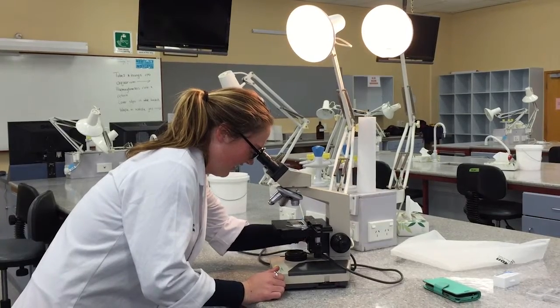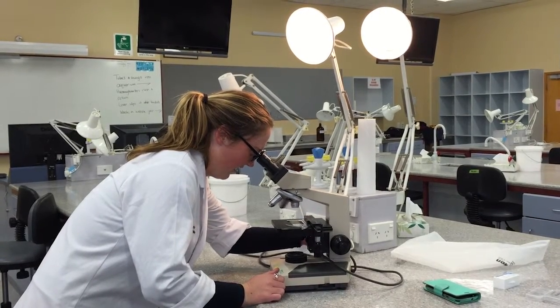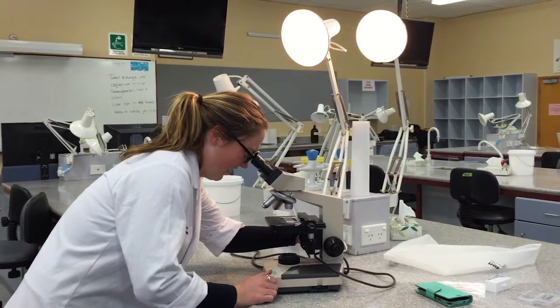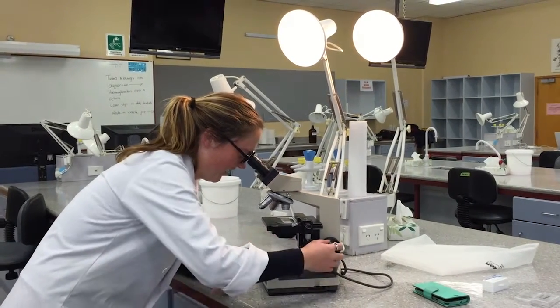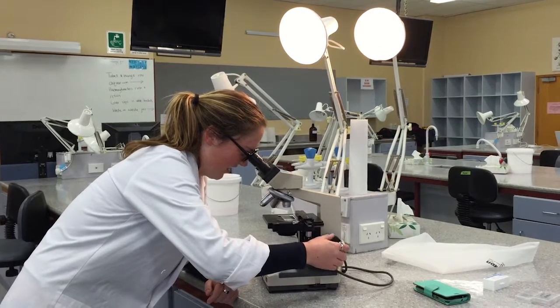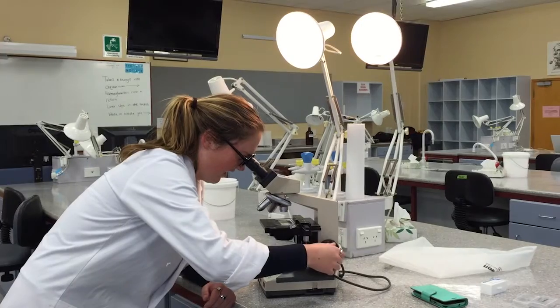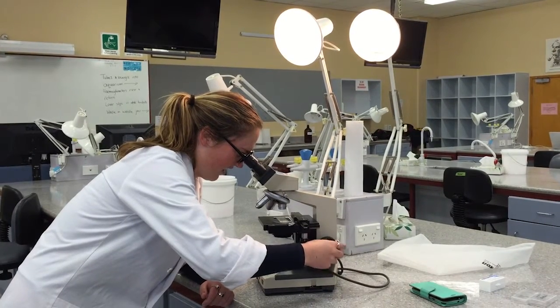Ensure the stage is lowered and the low power objective is selected. Cover the microscope with the plastic protective covering and, lifting by the arm with one hand on the base, place it back where it came from. You have successfully learnt how to use the compound microscope.